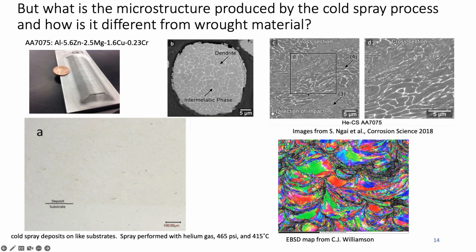One of the things to keep in mind in cold spray is that we don't really reset the microstructure. If you use a fusion-based additive technique, it remelts the microstructure and then it resolidifies. Now that can cause its own issues. In the case of cold spray, we simply take this little ball that has this microstructure and we impact it at high velocities into the substrate or into another previously impacted particle. So you can actually see the prior particles. We're going to call those prior particle centers. And then you also see that there are regions in between prior particles, and we're going to call those prior particle boundaries, and they have a very different structure.